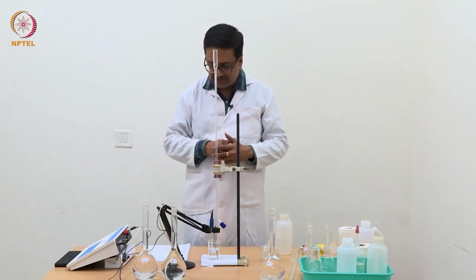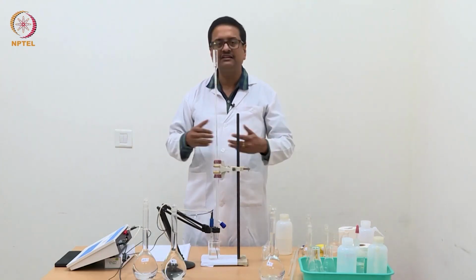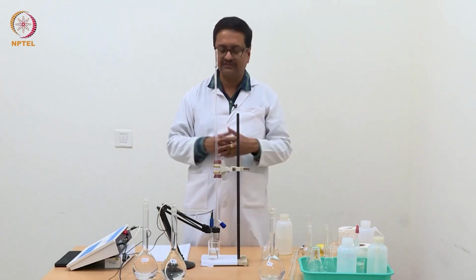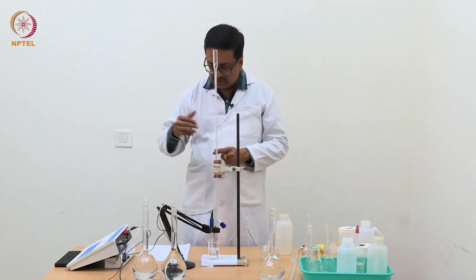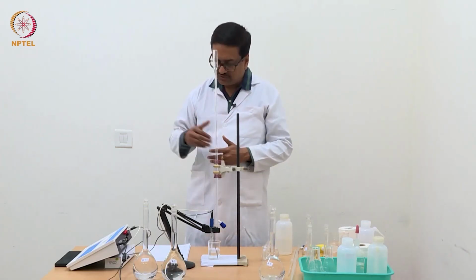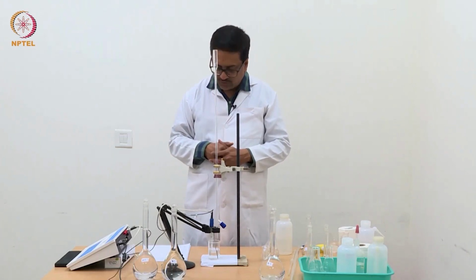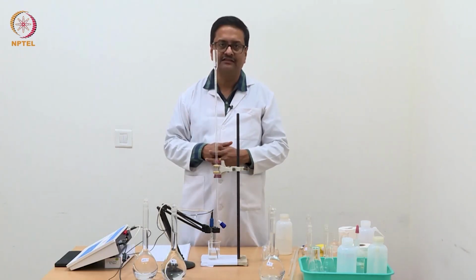Now this acetic acid is a weak acid, which essentially means that it does not dissociate completely. So one can determine the pKa of this weak acid from this potentiometric titration curve. This we will discuss in the theory part of the lecture.